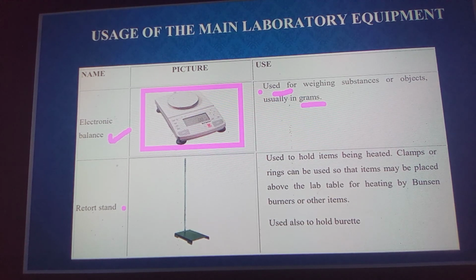Number 2, let us see about retort stand. If you see the retort stand by the image, it appears like this. I think you are observing it correctly. What is its use? This retort stand is used to hold the items being heated.